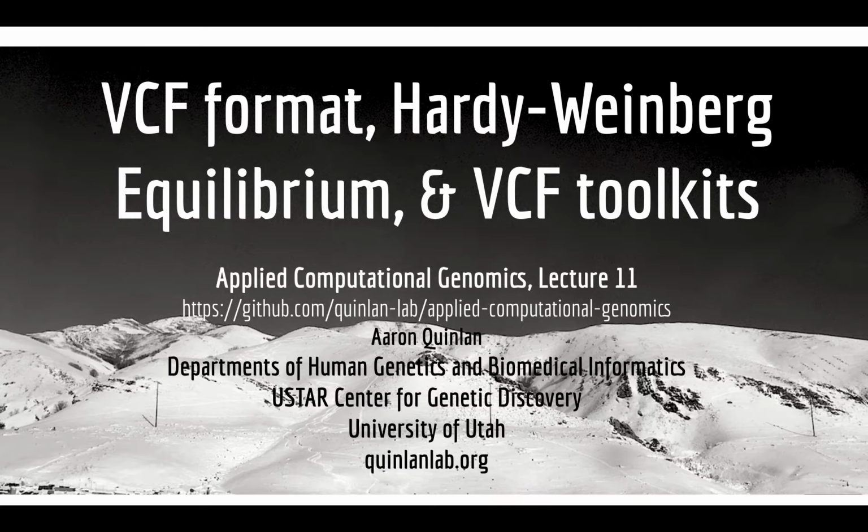Last time we talked about, the last two lectures were about how we use sequence alignments to find genetic variation when we've sequenced DNA from a diploid individual. What we're going to talk about today is yet another format that those variant callers emit to represent all the sites in a genome or an exome where the individuals sequenced seemingly have genetic variation.